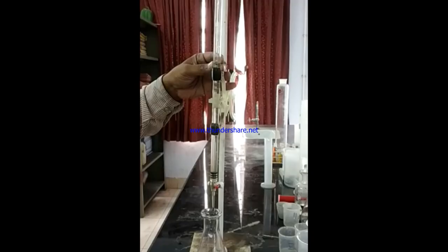Then we will store this BOD bottle with 300 ml sample in an incubator, and after 5 days, after having kept it at a temperature of 20 degrees centigrade, we will again take out the BOD bottle and determine the final DO by exactly the same process that we have seen in this video. Then we will find out the BOD as initial DO minus final DO, multiplied by the dilution ratio, that is volume of diluted sample by volume of undiluted sample. That will give us the BOD in mg per liter.